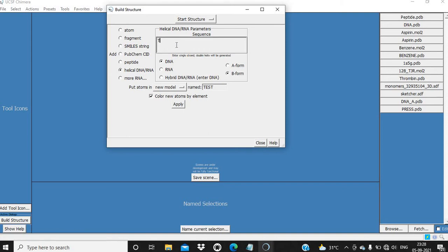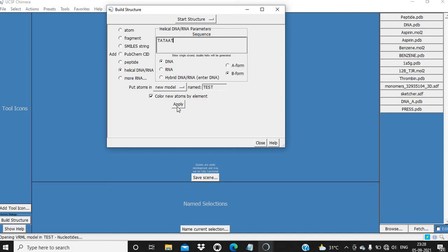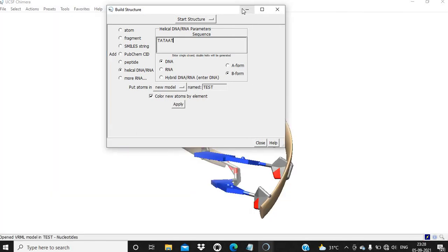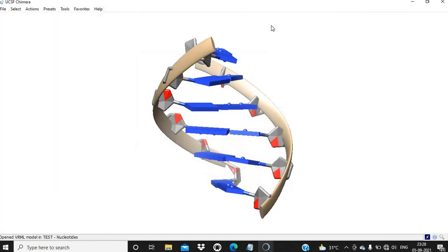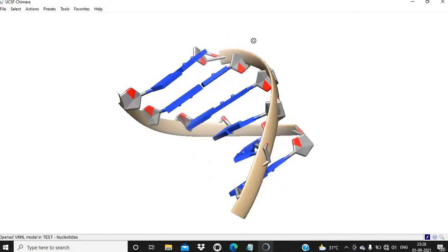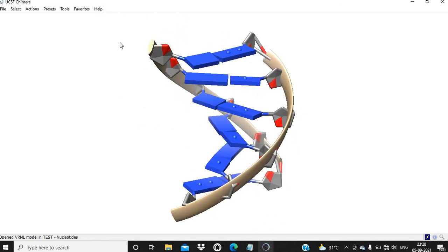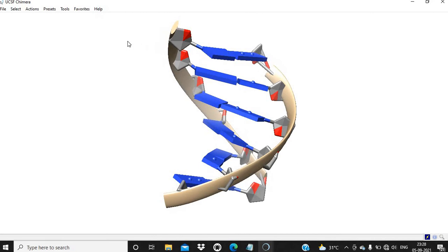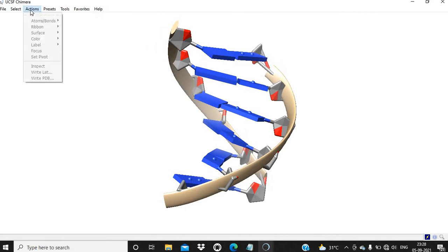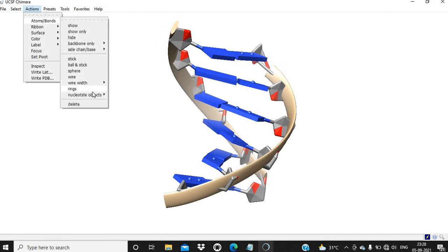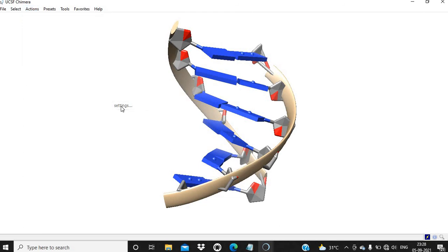We have to give only 5 prime to 3 prime sequence. I am entering here DATAT. This is going to be a DNA double helical structure. We can change the representation. Action, Nucleotide Objects, Settings.